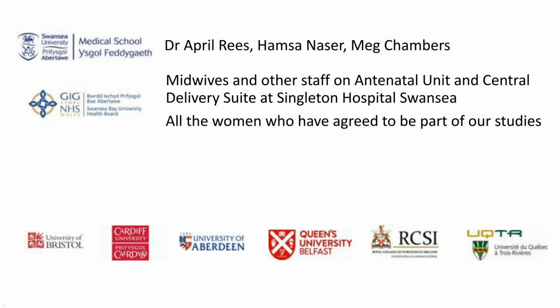Thank you both so much. Now, how many cells do you need to perform all the downstream applications? And do you have a threshold of purity and recovery for your isolated cells that will be used for Seahorse or NanoString, etc.? Yeah, I'll take this one. So I think I mentioned it during the presentation. So we run at about 92 to 95% purity, which would be our standard purity. So we would take those through.